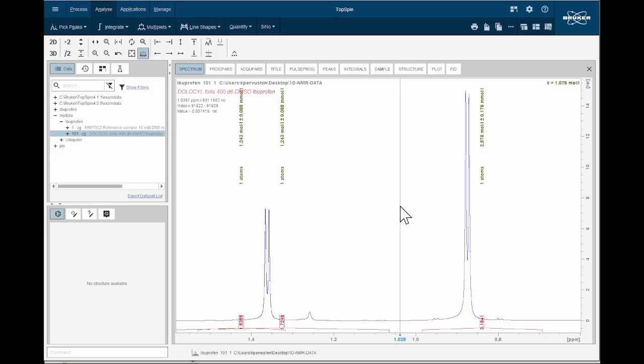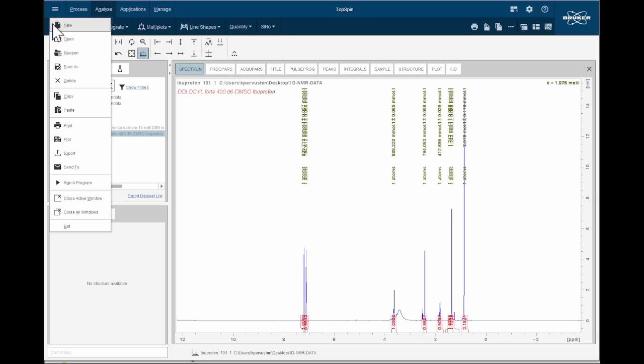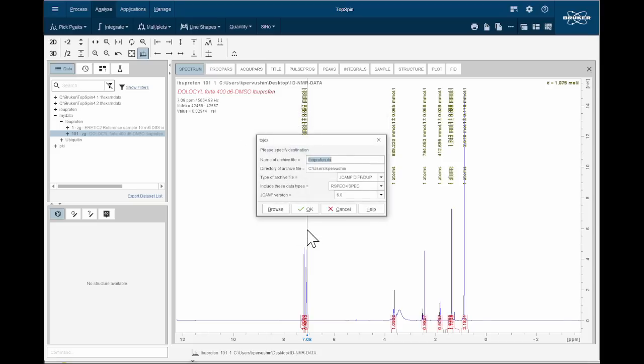And for the analysis of the spectrum, we have to export this spectrum and compare it with the predicted spectrum, to assign all of these lines. So how can we do that? We export this. We save the spectrum as a DX file.